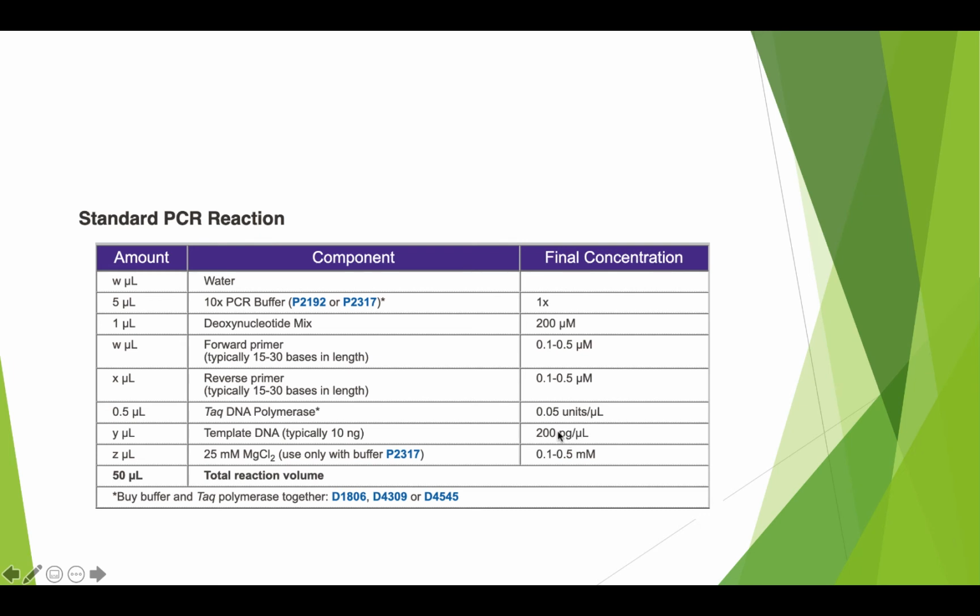You can add DNA up to a certain point. 10 nanograms, for example, of DNA, 10, 20, it might be fine.